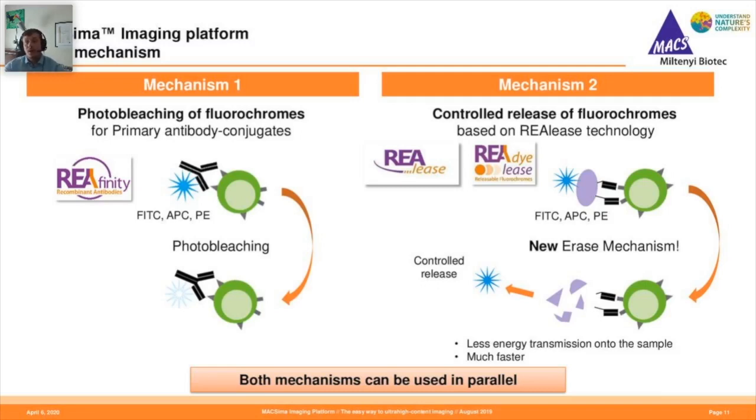But at our headquarters in Germany, we have done up to 400 markers from one sample using photo bleaching completely. So it seems that's obviously going to be really dependent on what sample you're using. Another thing to potentially consider here could be steric hindrance of different antibodies being bound onto all sorts of different markers, but again, that's really sample dependent, so it's really hard to say.